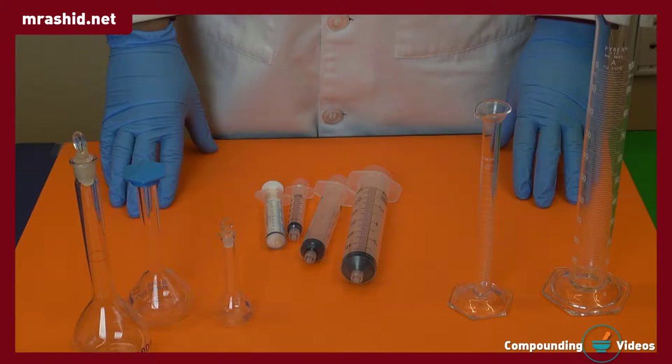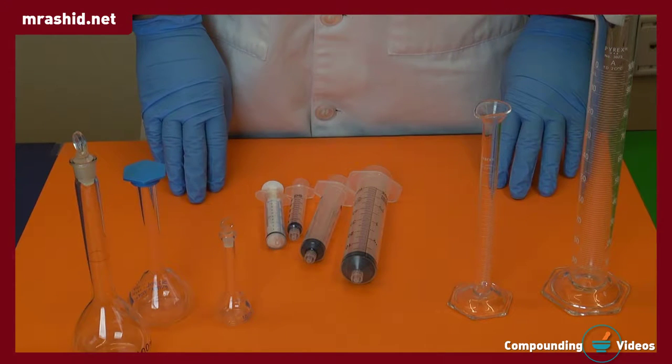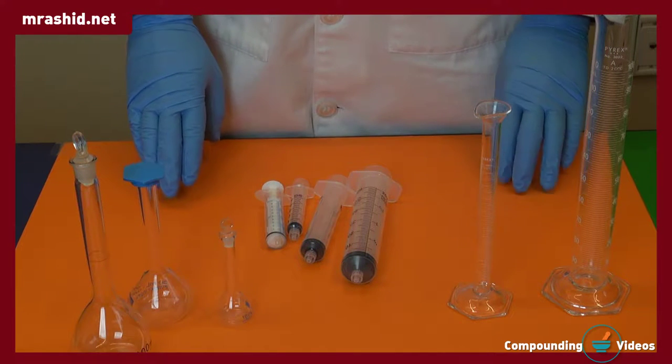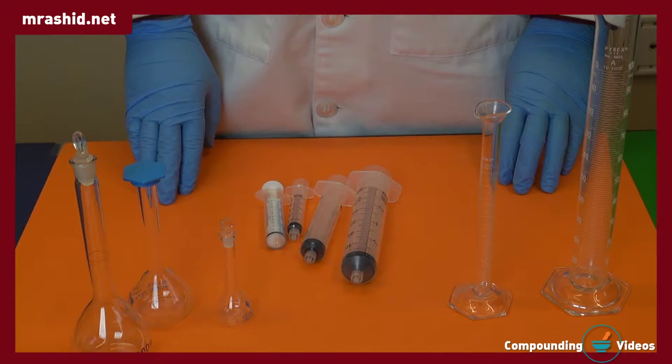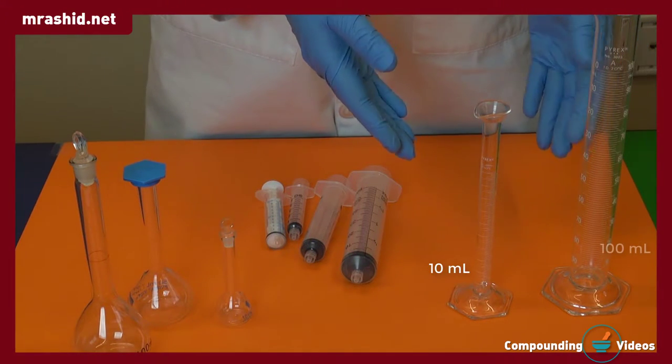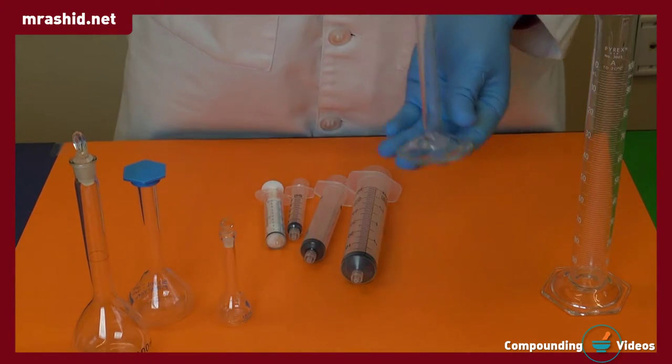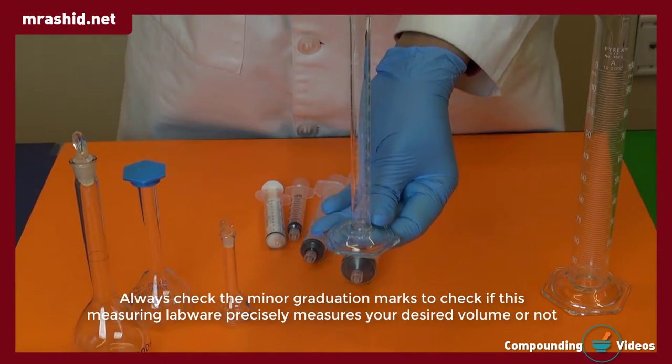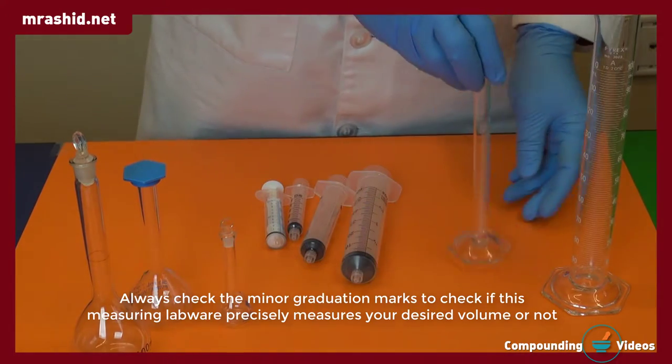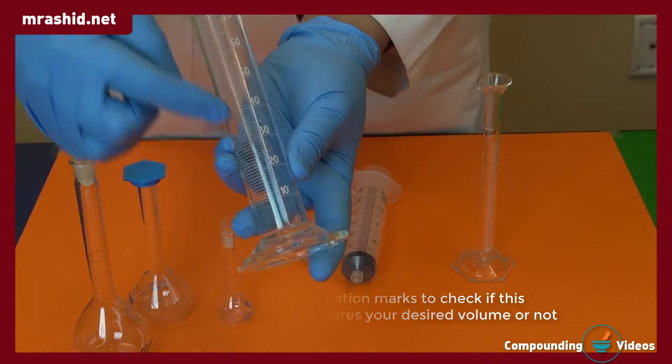Which size of volumetric measuring labware should you use in compounding? The rule of thumb is always use the smallest convenient size labware. Here's a 10ml and a 100ml measuring cylinder. If we need to measure 8ml of a liquid, then this 10ml cylinder should be ideal. The 100ml one cannot be used because it does not have any graduation mark below 10ml.